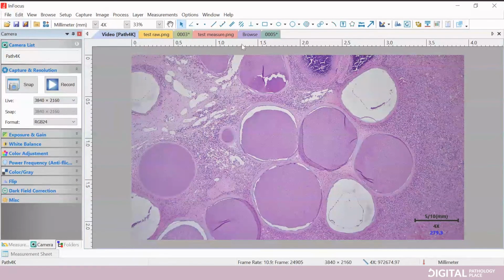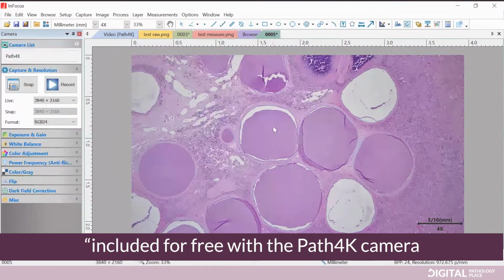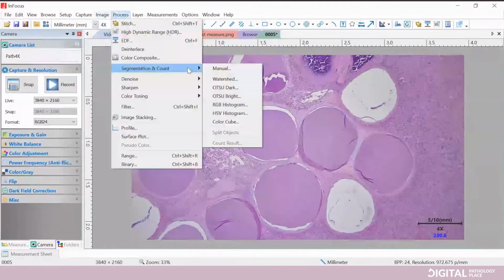And also, Alex, I have to be honest with everyone here. This also is included at no extra cost in the software. Again, these AI software and programs are extremely expensive in some regards. So this is a very basic way to do it. But there's a couple different options here, and the help guide goes through all of these in much greater detail.